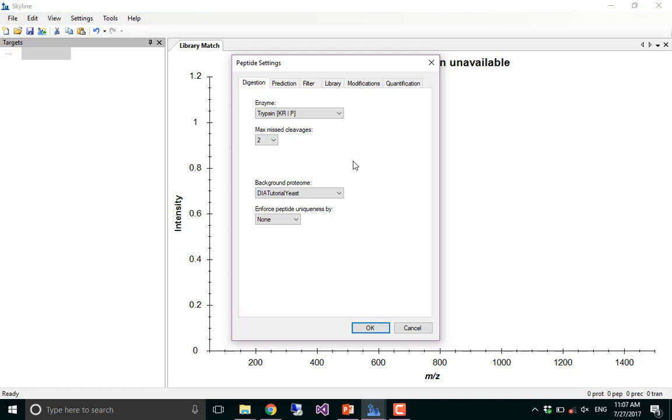I also have a similar question. Is there a difference from doing all these steps from here than from the start menu? Oh, the wizard? I don't think the results should be different. It's just two different ways of going about it. Everything you can achieve from the wizard, you can also achieve doing it from here.